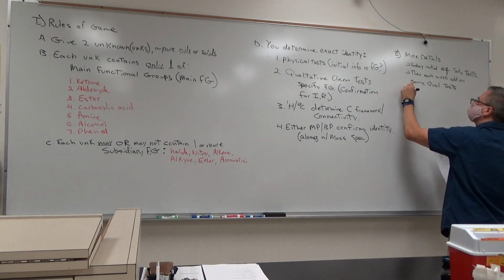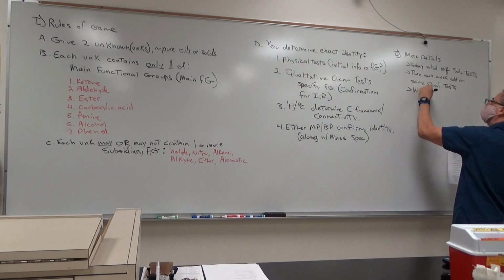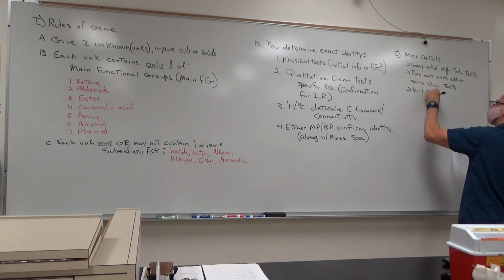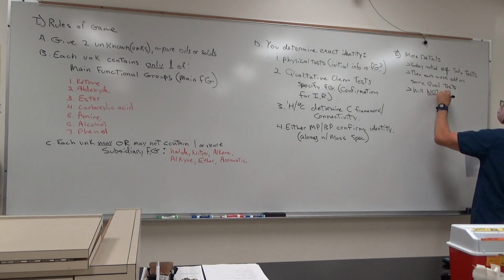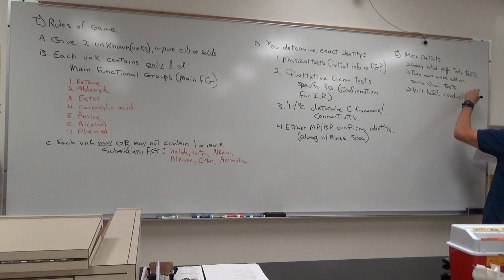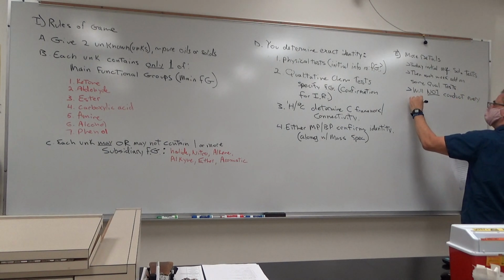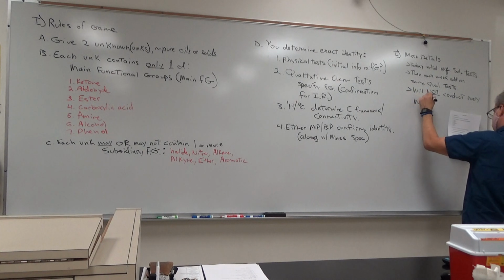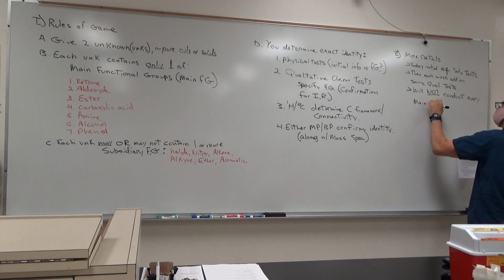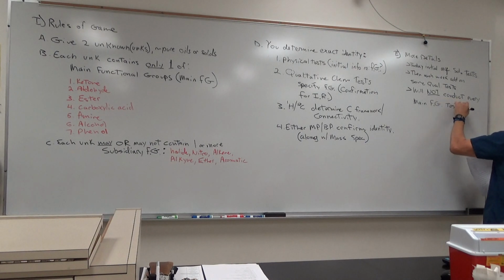Qualitative tests, both main functional group and subsidiary functional groups: you will not conduct every main functional group test on every unknown.